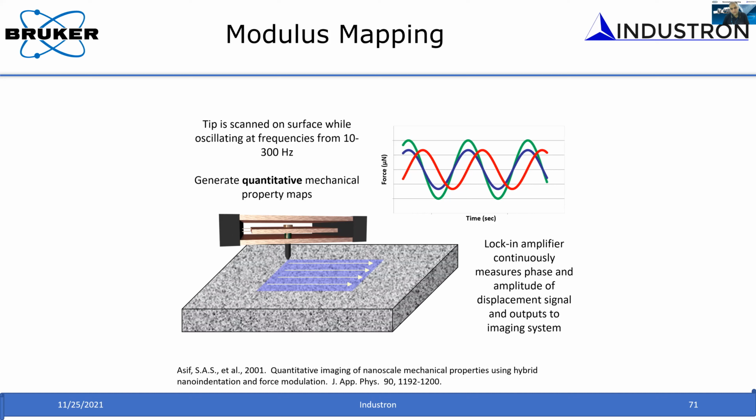In this presentation, I mentioned that you can measure the dynamic properties, and along with that, you can also measure the creep resistance. The dynamic measurement technique that I presented today is a very, very sensitive measurement technique, okay? Because you're measuring stiffness as a function of time. You can measure a stiffness of about 10 newtons per meter, which is basically the stiffness of atoms in contact, okay?